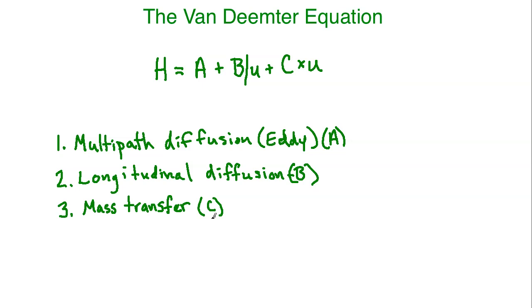But when you look at the bottom, there are still these particles, these little beads, if you want to call them that, right, that are there. And so the question is, how quickly or how rapidly is the analyte mass transferring particle to particle? And is it all the same? Because it turns out that it's not always the same, and we'll discuss why in another minute here.